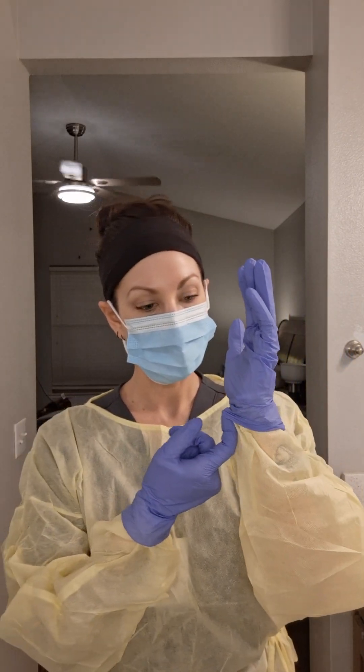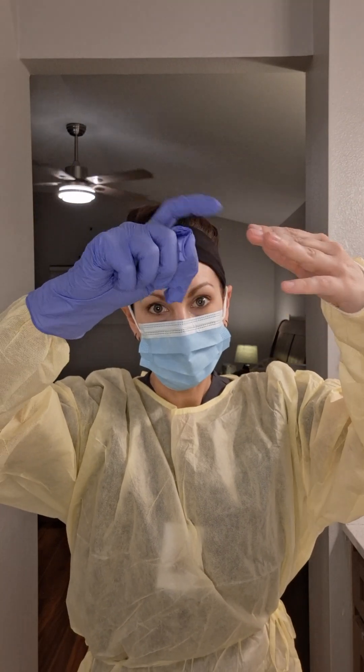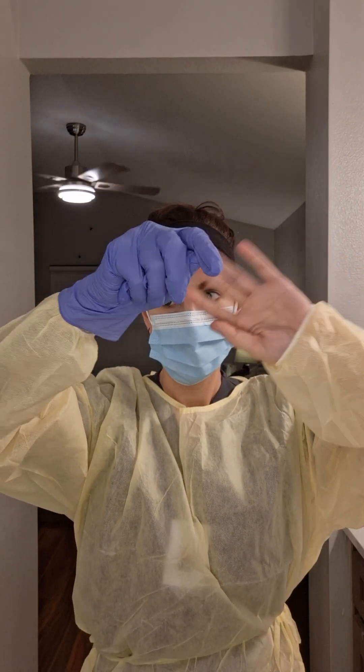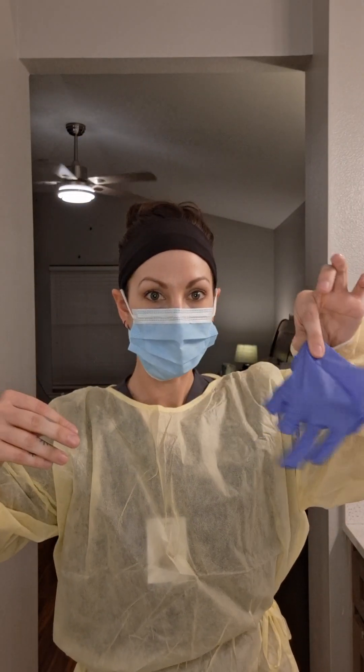Take my finger and go on the inside of the glove, turn it inside out, and crumple it up. Take the other hand, put my finger on the inside, turn it inside out, and discard in the appropriate receptacle.